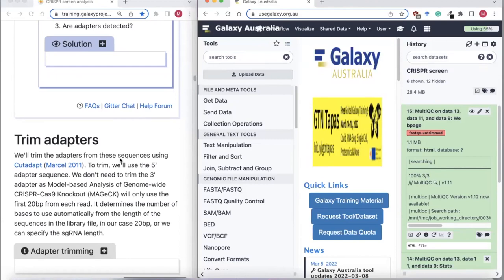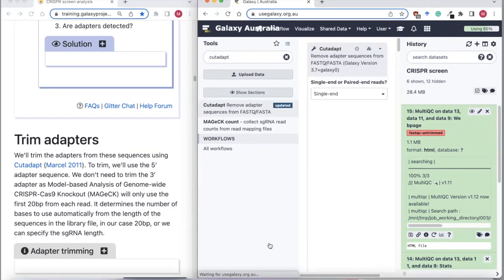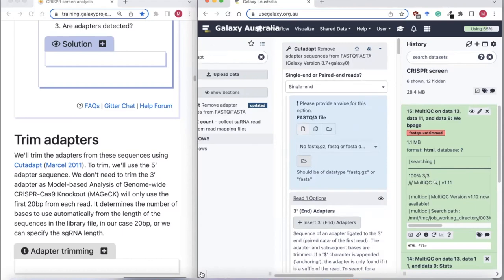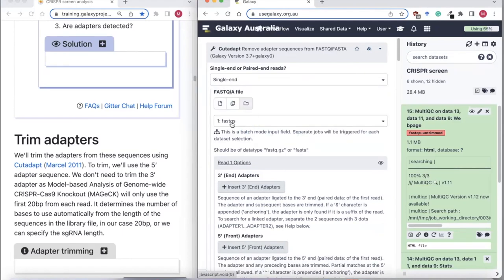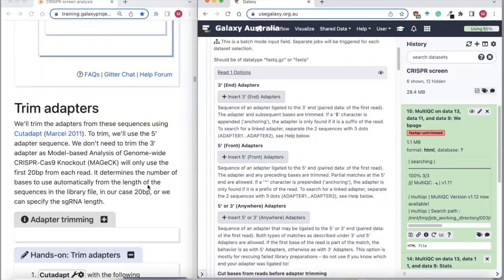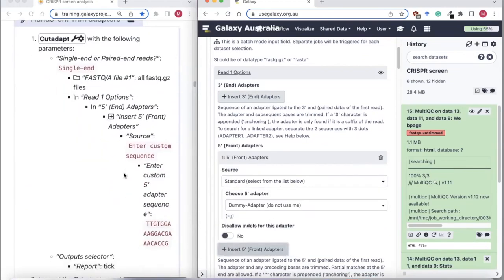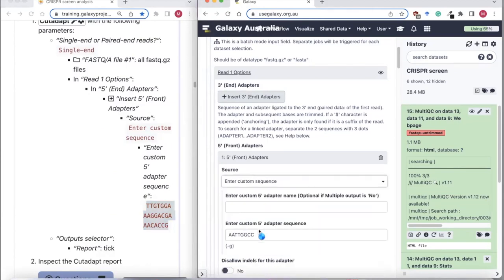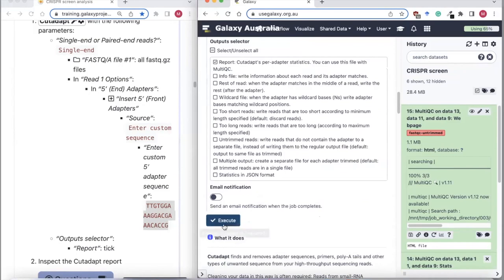Now we'll trim the adapters from our reads using the CutAdapt tool. Our data is single-end. Again, we need to say it's a collection and input our FASTQs. We're going to tell CutAdapt we want to trim adapters from the front, entering that 5' adapter sequence. I'll select to output the report and start that running.